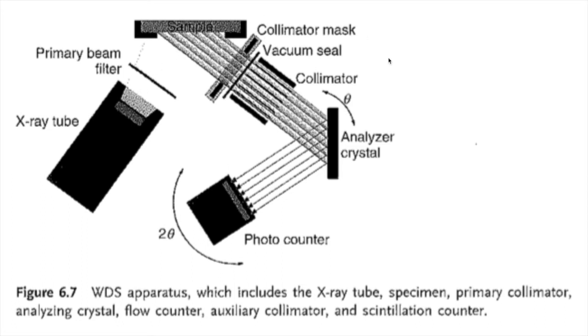But over here, where we have basically the diffractometer, is the additional component. And so we have what we call an analyzer crystal. And so this is our known single crystal that allows us to evaluate the wavelength because we know the d-spacing. And so we can calculate the wavelength because we know the d-spacing and we know the angle.